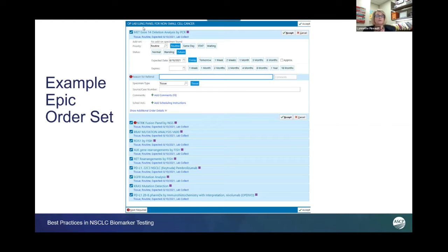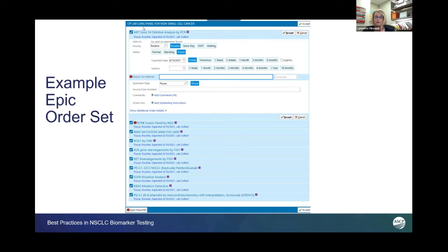You can see this order pops up. The Met exon 14 deletion analysis is open so you can see what this looks like. It is all pre-checked. All of these are already pre-ordered. If the oncologist wants all of these tests, they just hit send and it goes.